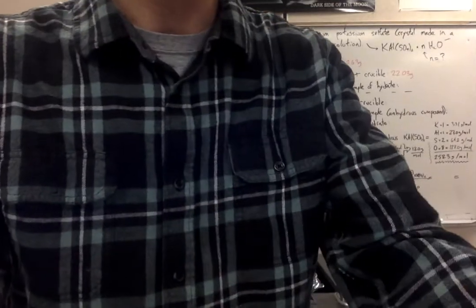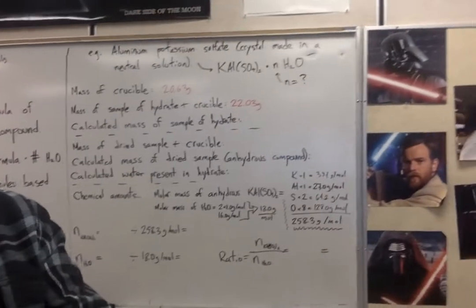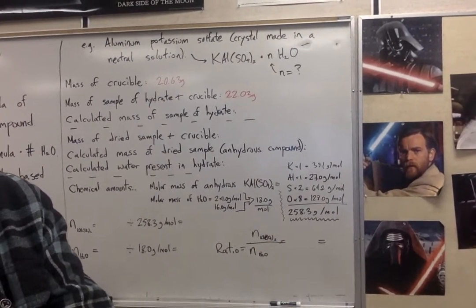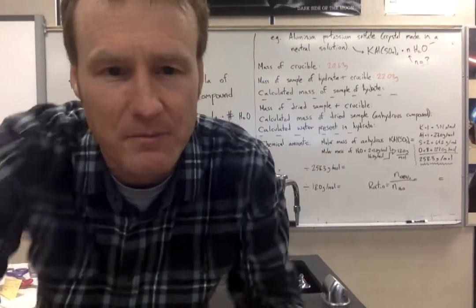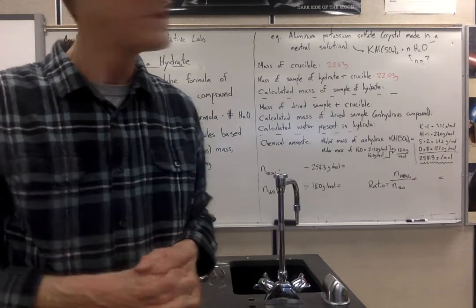Here's what we're going to do. Here's how we're going to start. I'm going to demonstrate the lab with one compound, and then I'm going to give you the results for a different compound. So here's where we're at. Now, I actually have some results in here already. What happened is I was doing this lab earlier today and had a bit of a blooper, I guess is the expression. Something came up and I stopped the video because I wanted to make it better. So as a result of that, I actually already have some data in there.